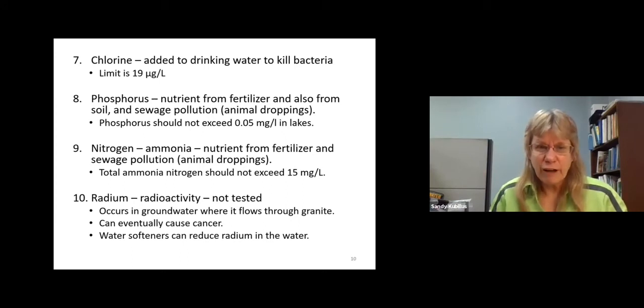We're going to also test for phosphorus and nitrogen. Phosphorus and nitrogen are nutrients, remember, from a few slides ago.